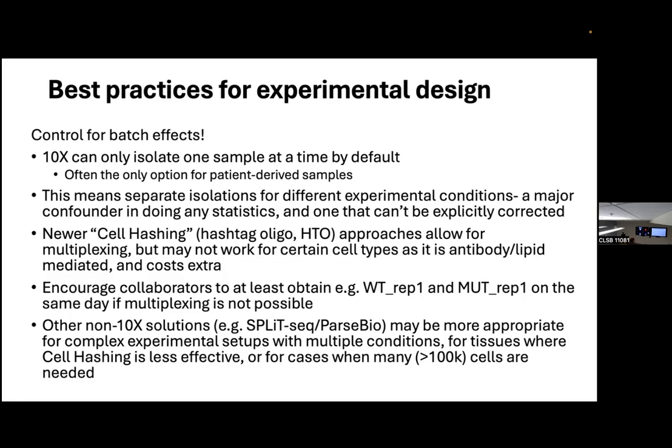Human samples are a bit more of a challenge here. Often you don't have the tissue available to do the kind of replicates that are statistically ideal. Let me give an example in mice, just because that's a little bit easier to think about. If we were just interested in comparing mutant versus wild type, that would mean 5 animals of wild type, 5 animals of mutant. That would be what I would consider a biological replicate. Those are completely independent tissue or cell isolations from individual animals.